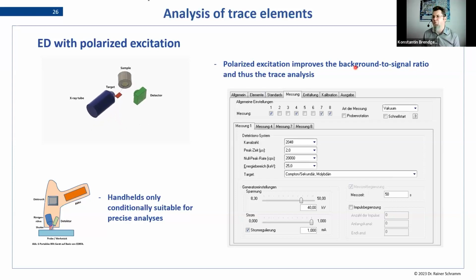We get rid of the scattering and the background noise of the X-ray measurement, which in turn allows us to count small amounts of atoms with a lot more precision than we would be able to in other setups. This really makes the measurement with the energy dispersive X-ray with polarization just perform better. And just to give you an idea, in the method that we are currently using, we have 4 conditions running, and this is the example of one.